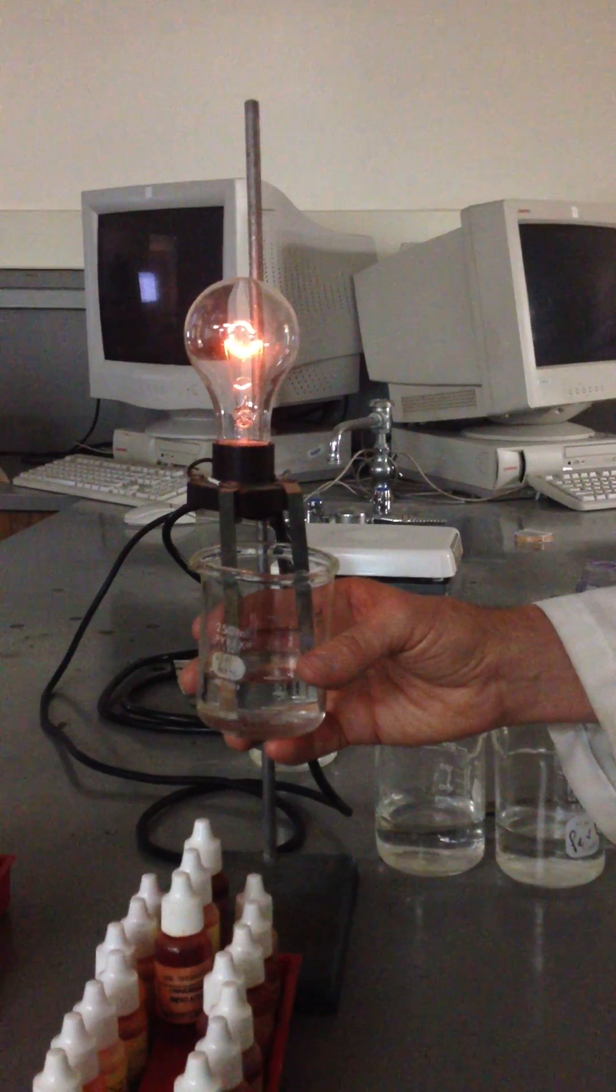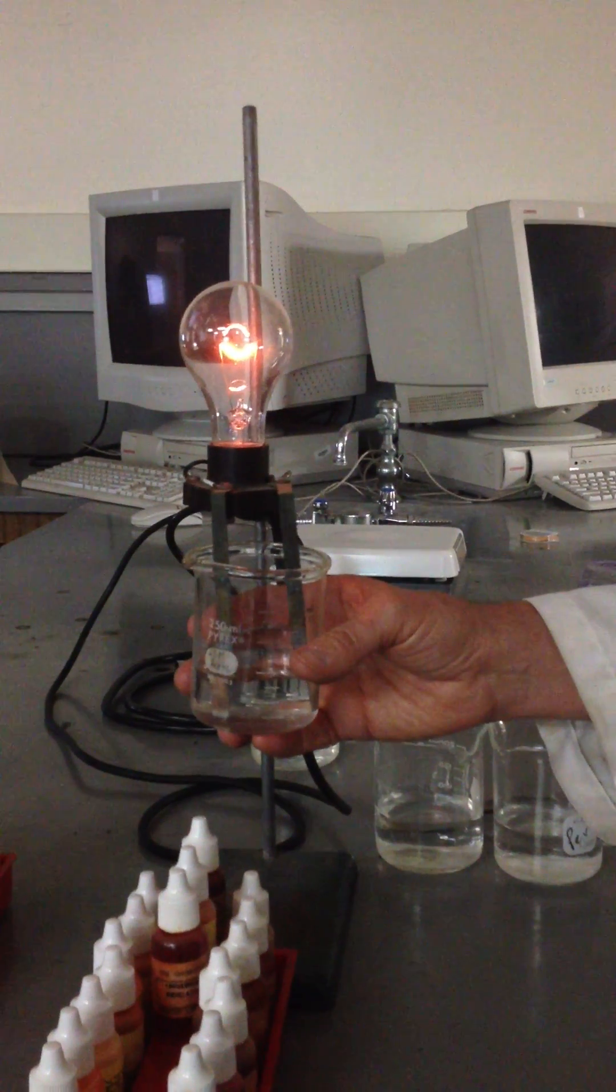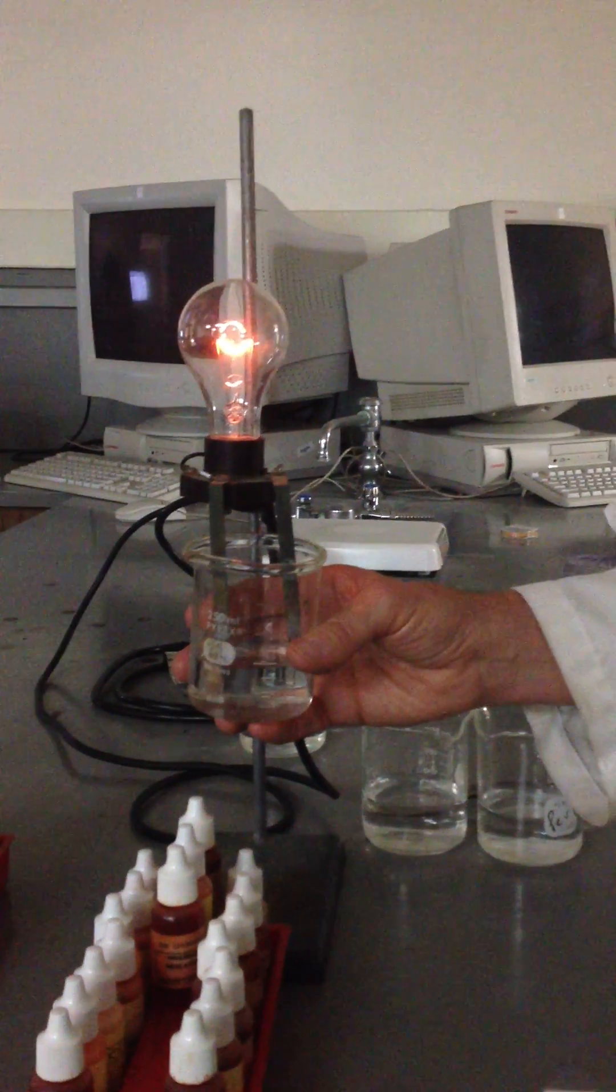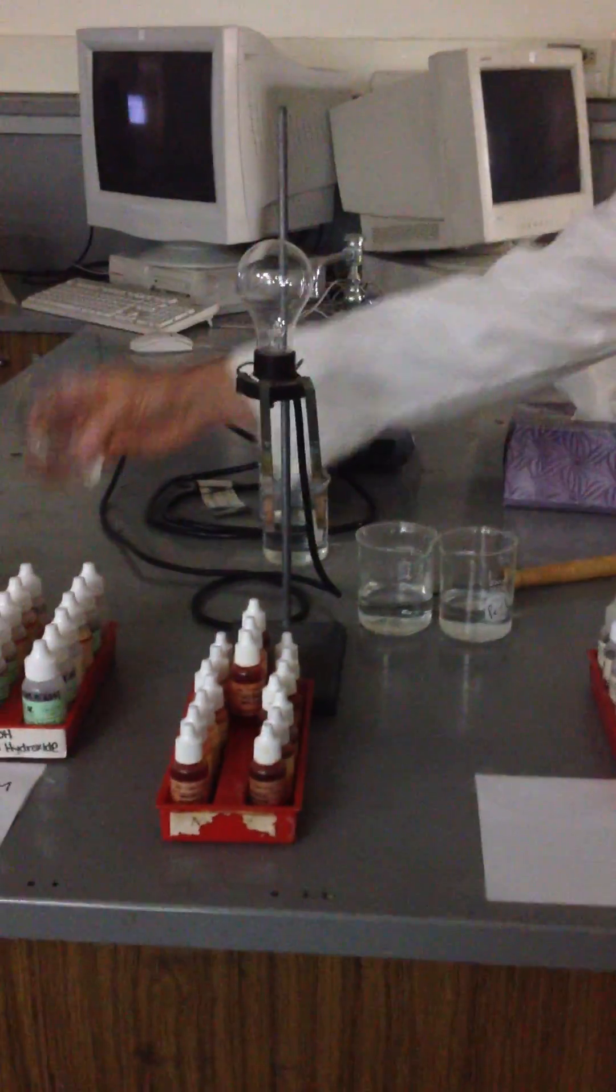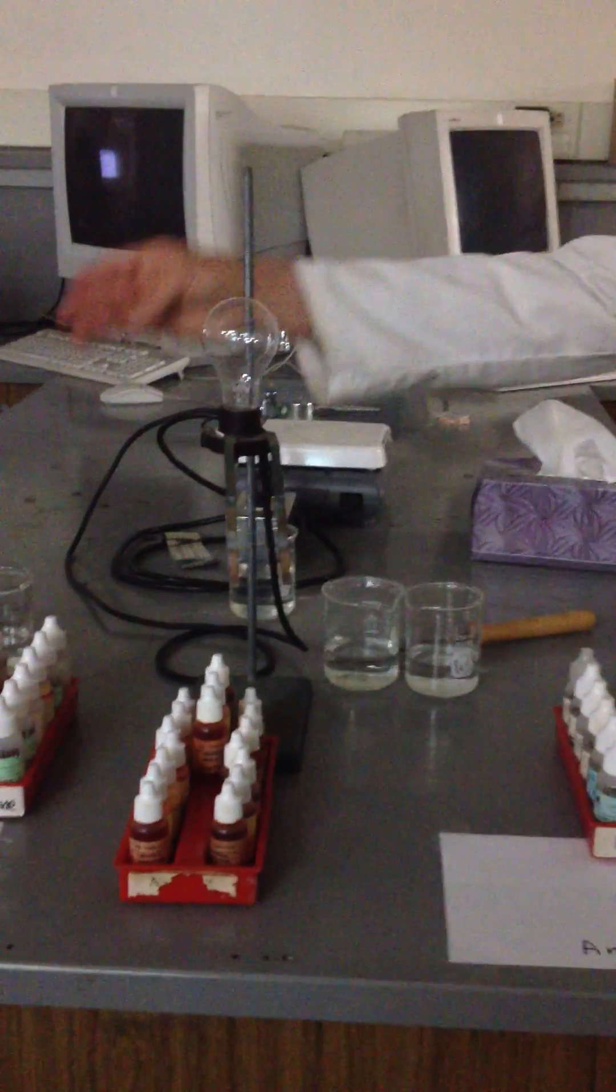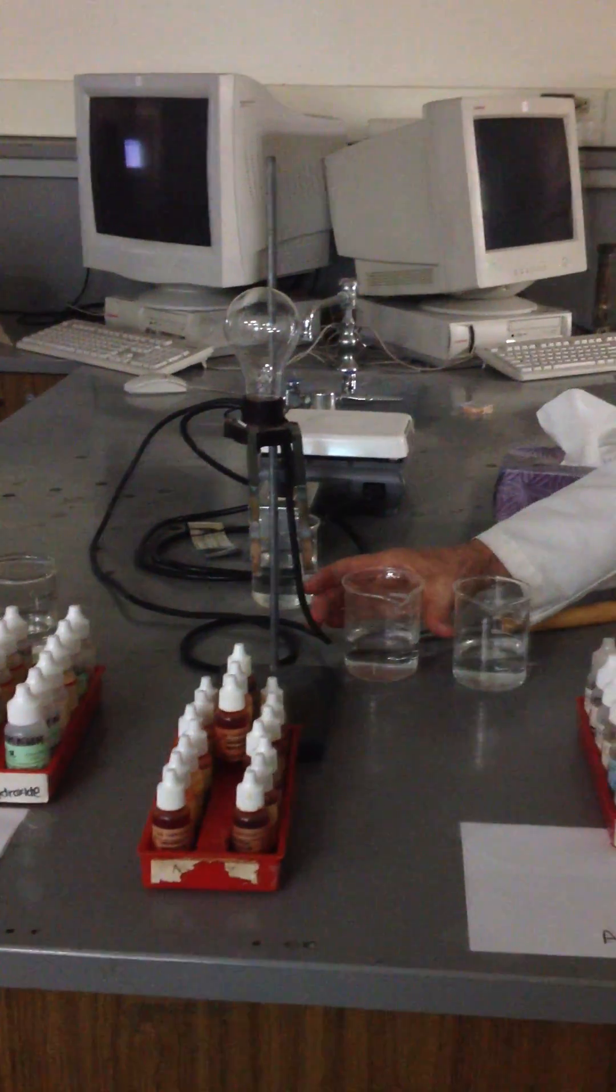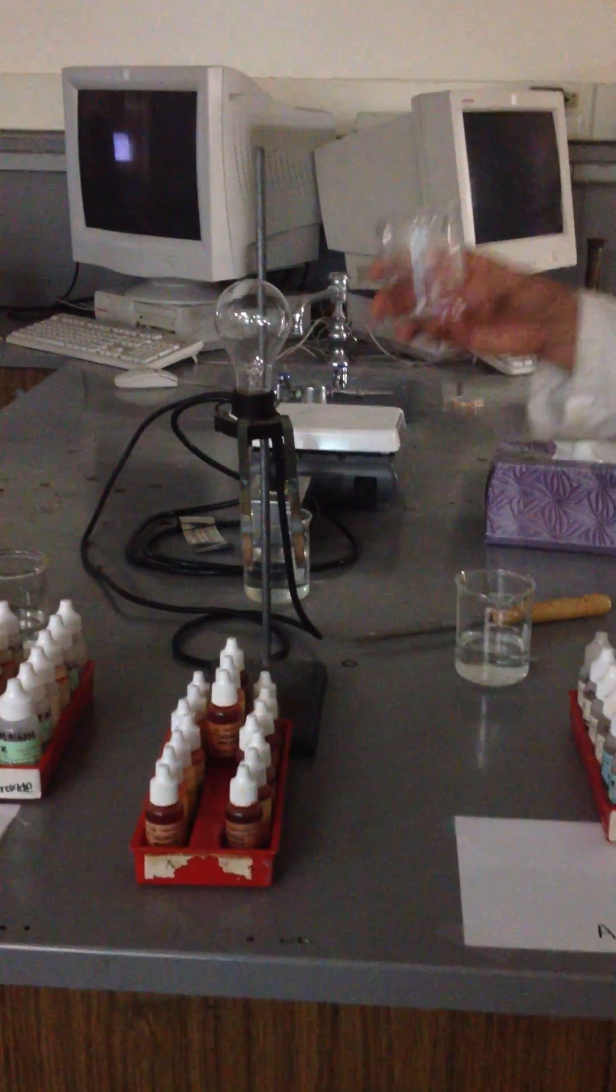What does that mean about the number of ions in the water? Very few. A bunch less. Yes, a bunch less. The brightness of the bulb correlates to the number of ions.